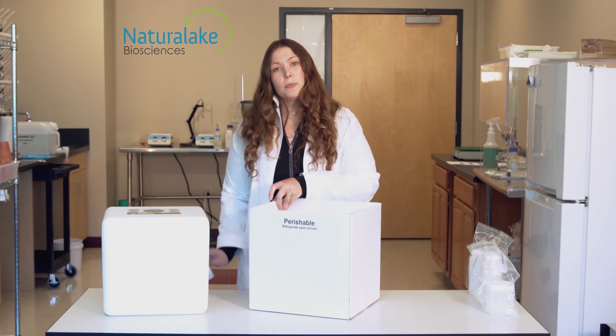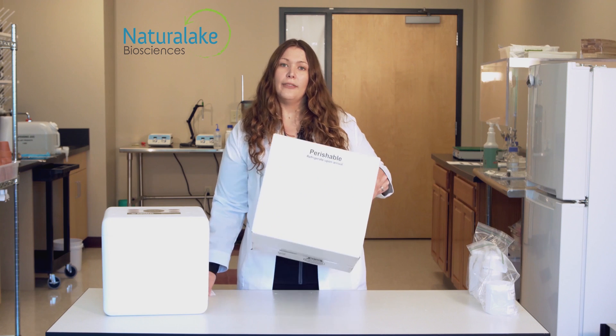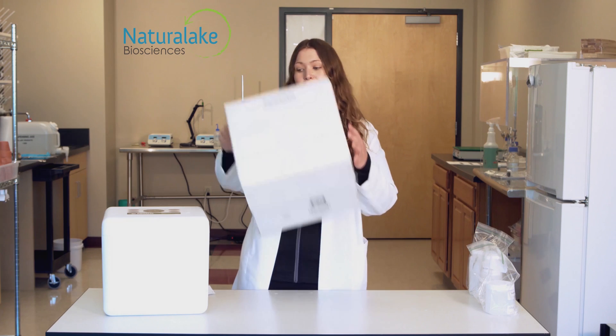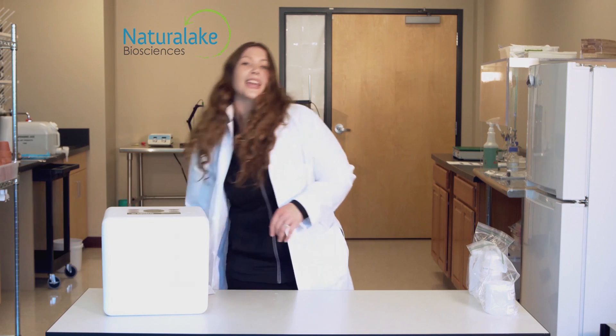The note on the box — perishable, refrigerate upon arrival — is for the return trip. There is nothing perishable in the kit that we send to you. If you have any further questions, please feel free to contact us. We look forward to seeing your sample.